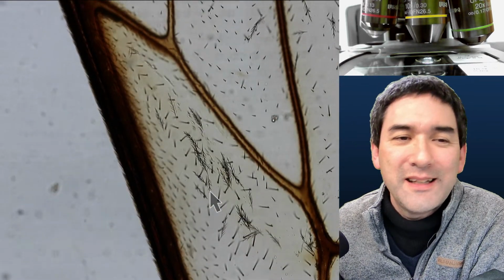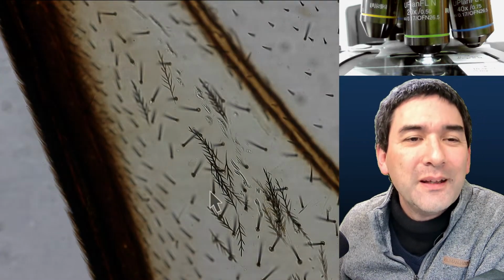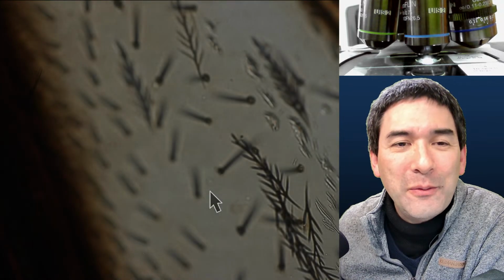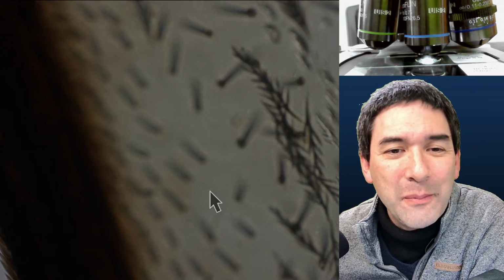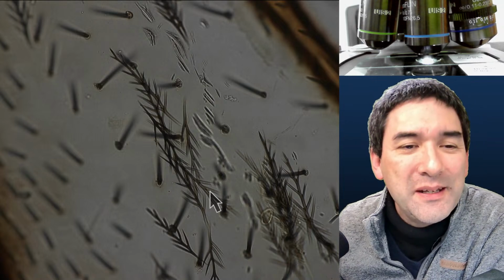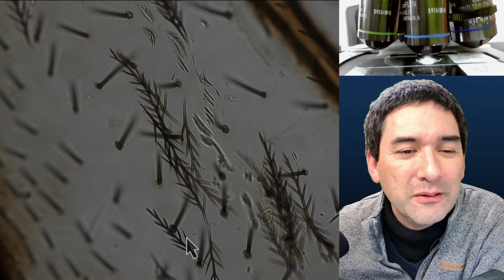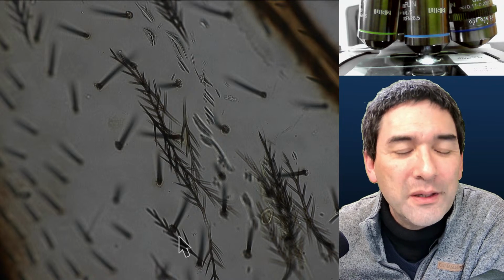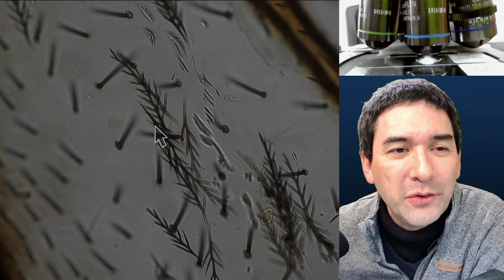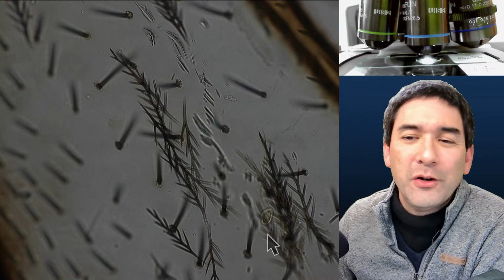Look, that's also nice. You occasionally find this even in honey. Those little strange structures are basically some hair that you sometimes find on the bee itself. I found they looked a little bit like tiny branches, but I found them also in honey. So these seem to be kind of hair that are found on the bee's body itself. But they are now here also on the wing.